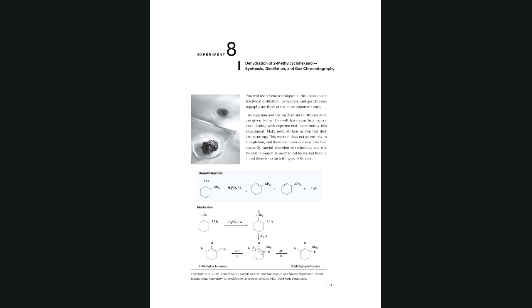So you have very strong intermolecular forces. As a result, you are going to get a much higher boiling point for the reactant and a much lower boiling point for the product compared to the reactant. So when you do distillation, the reactant or reagent is going to stay in the boiling flask, and the product will be distilled into the receiving flask.